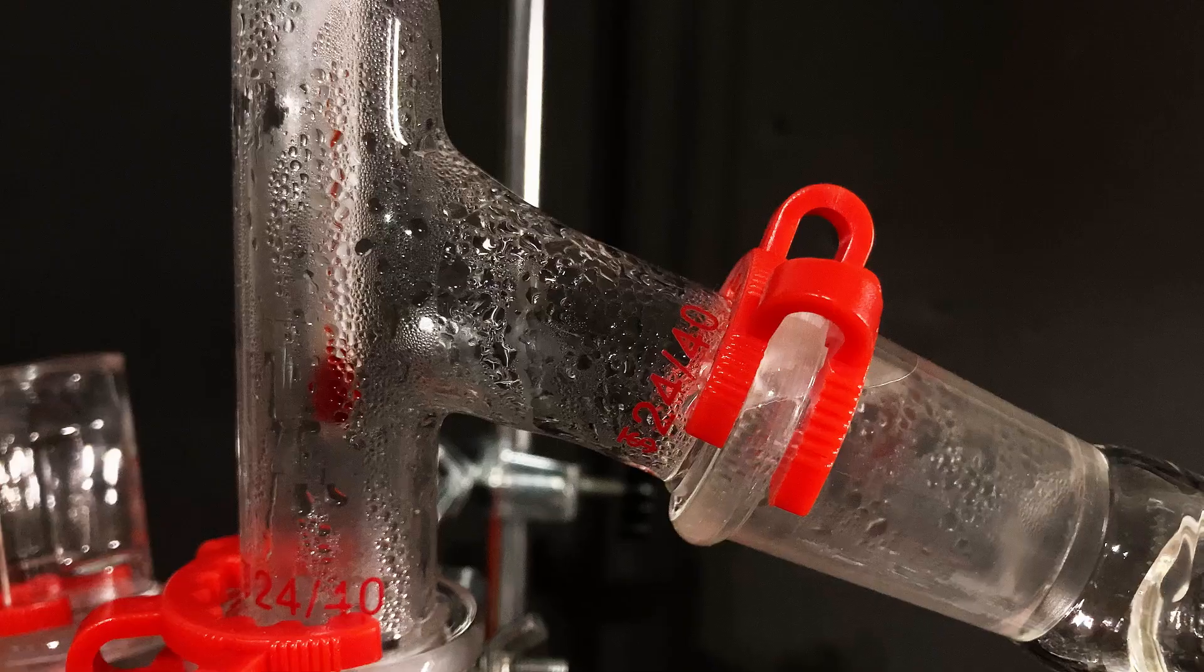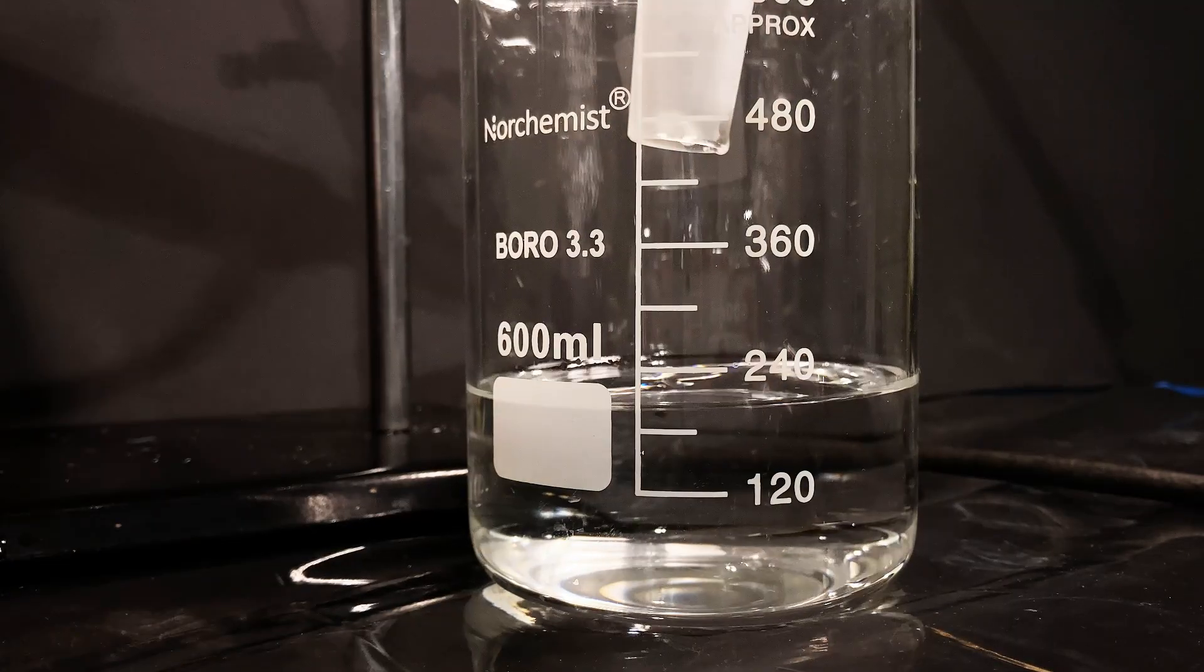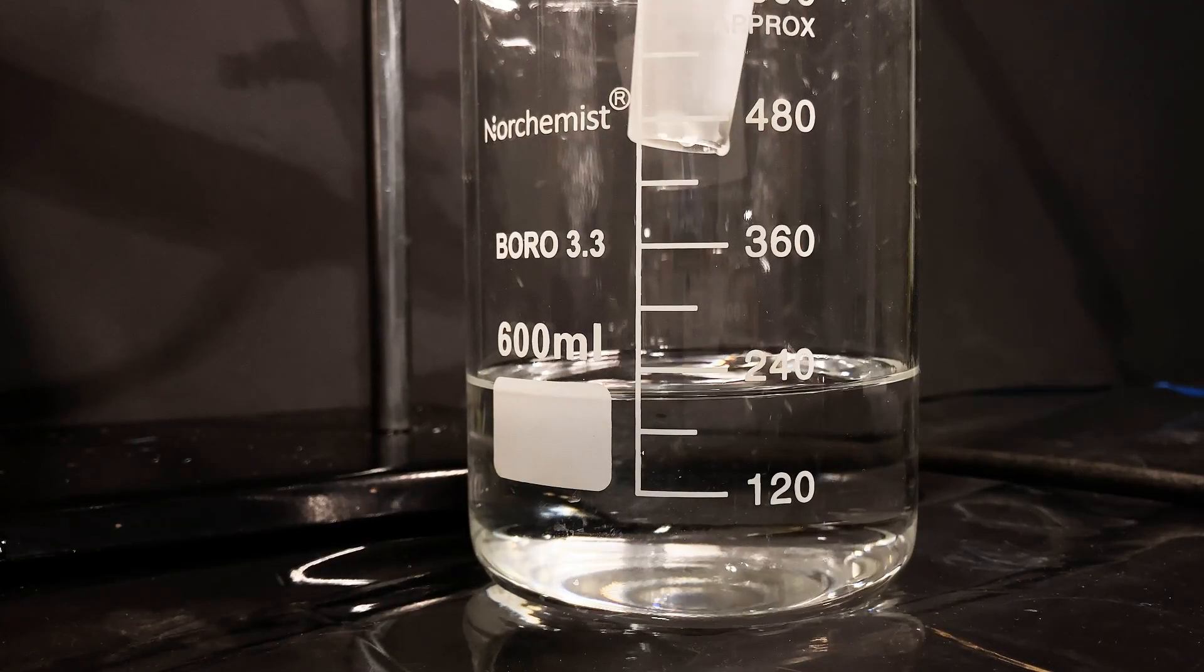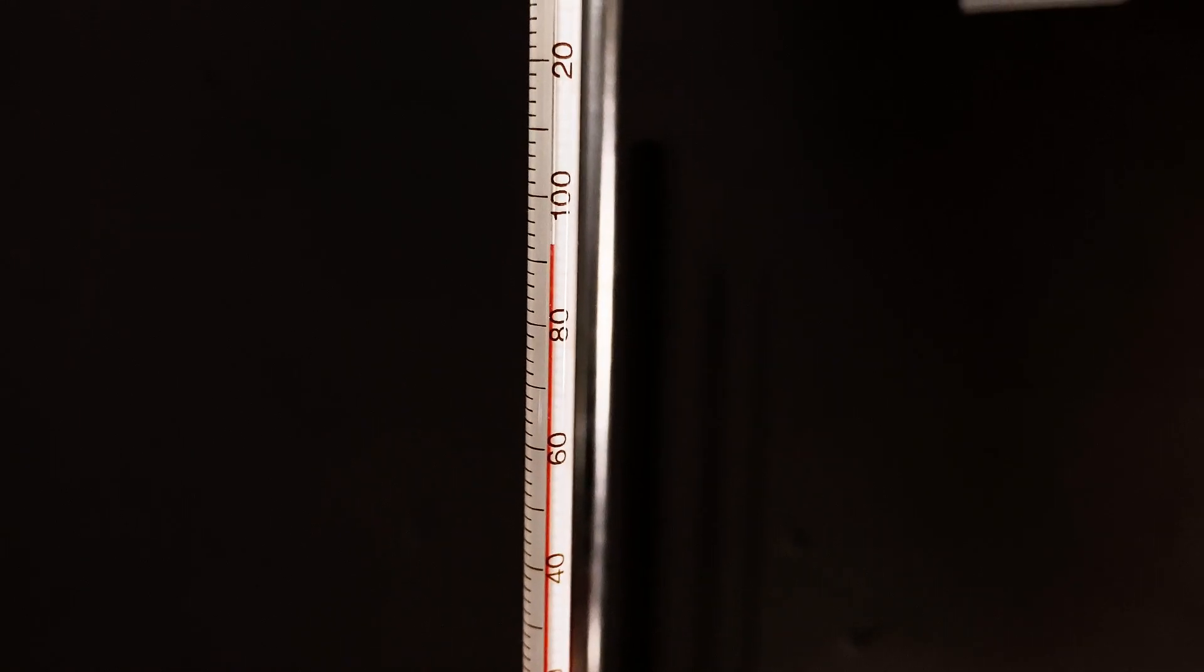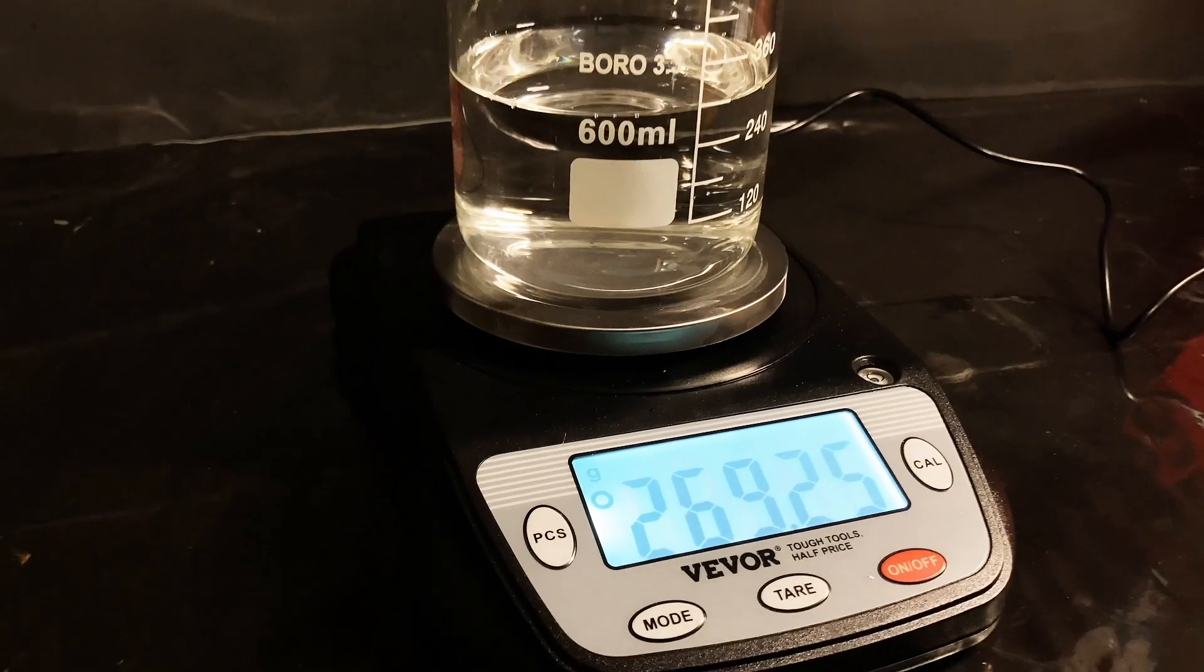I knew when the distillation was basically done when the temperature on the thermometer started rising again. I immediately turned off the heat when it went above 90°C, and I was left with this aqueous solution of isopropyl alcohol.